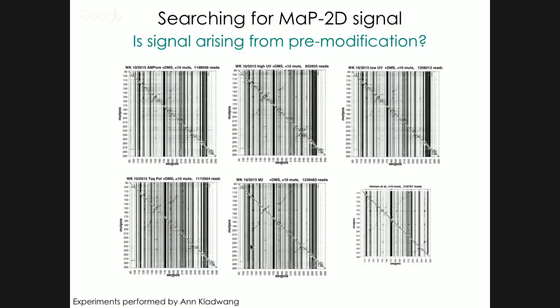So Anne performed the standard capillary electrophoresis experiment with a separate reaction for each mutant in the library, and then combined them all for the sequencing. She made the mutants all separately. Oh, she combined them for the modification. Yeah. Right. And then she pushed them through the same protocol. Yeah. So that library was guaranteed to have exactly one mutant every 200 nucleotides.